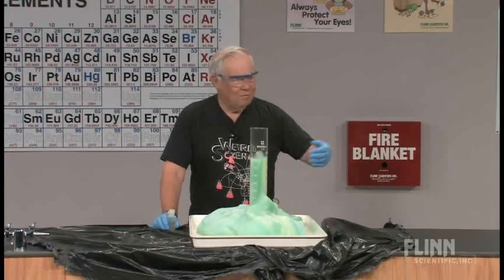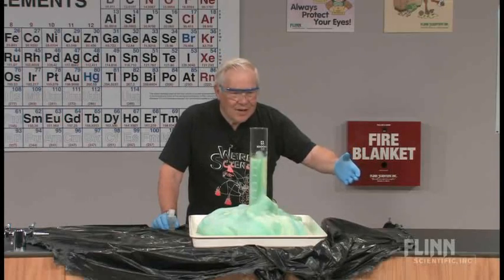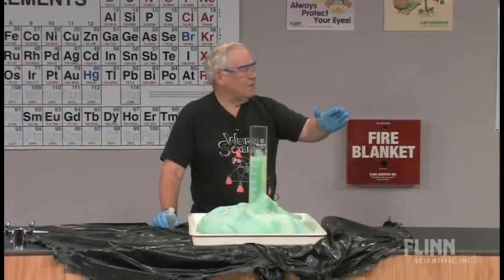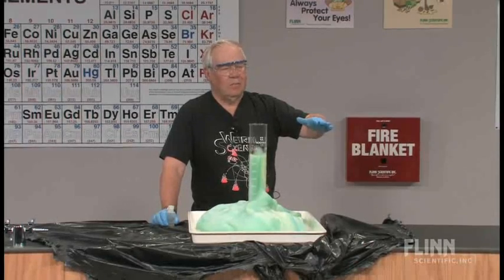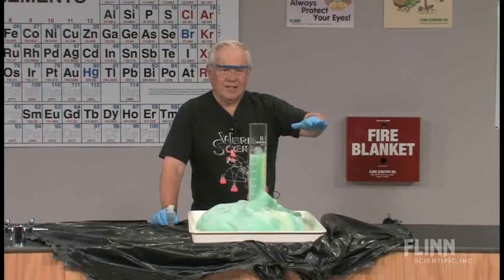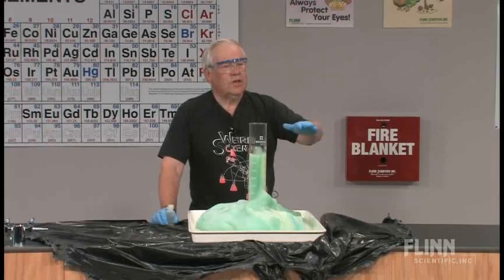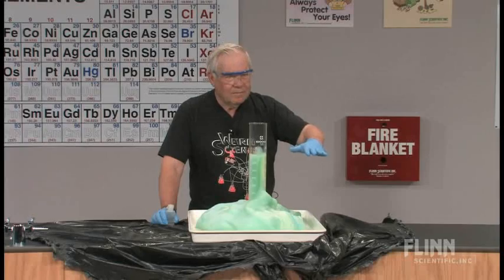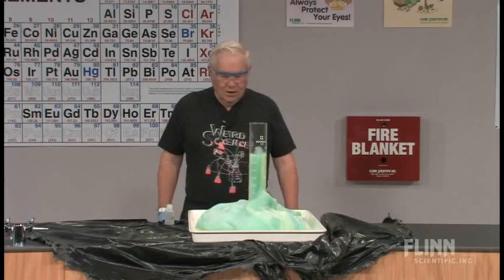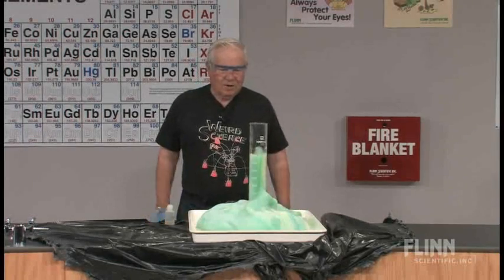You put in two pieces and it makes it twice as fast if you get the same size, because of the surface area. The manganese metal probably has manganese dioxide a little bit on the coating. And so you can control a reaction very, very well with manganese metal. So that's probably my favorite reaction.